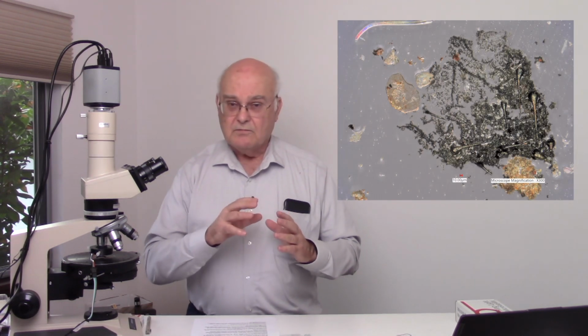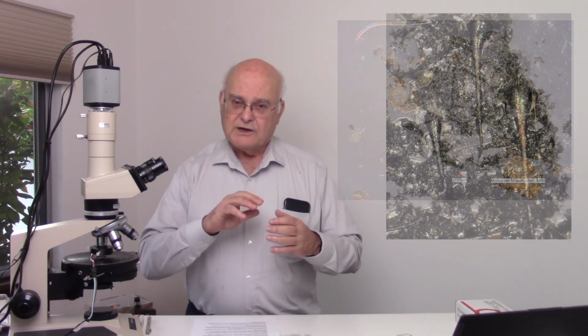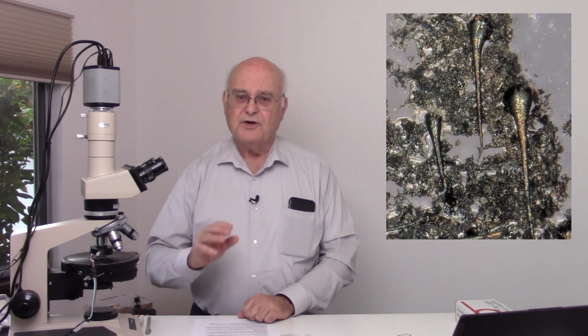So ash coming from these plants, we can understand, we can identify, but what are some of the characteristics that tell us, for instance, that the silica phytoliths have been exposed to flame? One of the things is they are quite often marked with soot or with what's called a carbon mirror, where the carbon actually has plated out on some of the materials, making it appear darker.